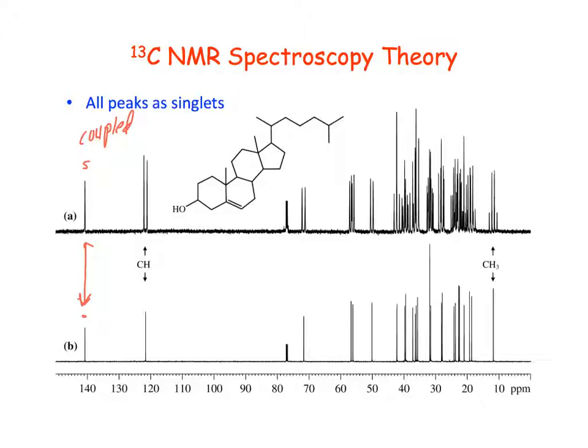I'll tell you about some different reasons in a minute, but one reason is that if you take any singlet and split it into a doublet, a triplet, or a quartet, then it gets smaller and gets closer into the noise. Unless you have really good signal to noise, it reduces the peak heights. For example, this peak is now a doublet, and that means that it's a CH. It has one proton attached. We're just looking at the one-bond couplings here.